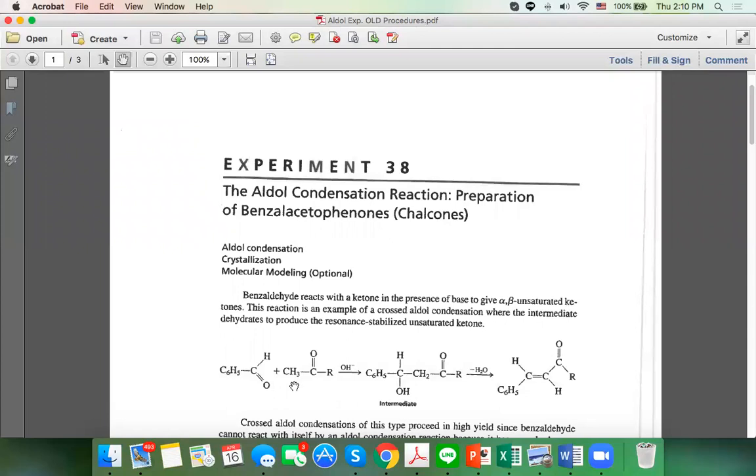It is real. So ladies and gentlemen, if I say aldol product, now this is the target product. In your reaction today, you will produce aldol product. But what is the byproduct? The byproduct is water, all because the base and the alpha hydrogen together create water.